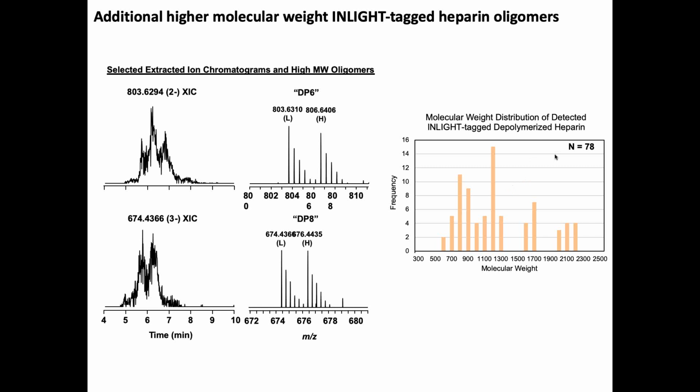So, yes, sir. What is the information that we can get about the linkages in even the O glycans, N glycans, and their MS, and the changes in 1,6, 1,4, 1,3, all of those? How do we determine that from these spectra? Are we talking about the branched O links?